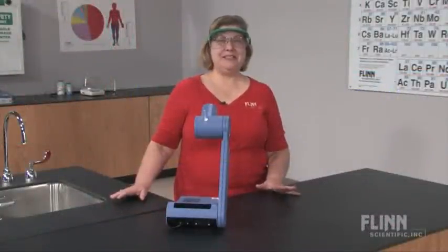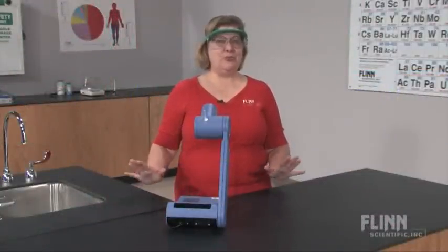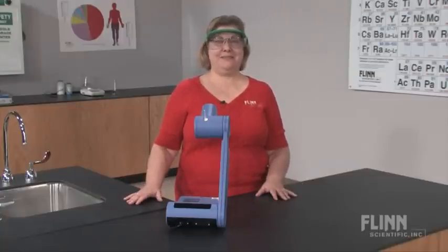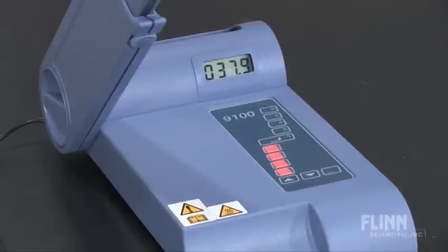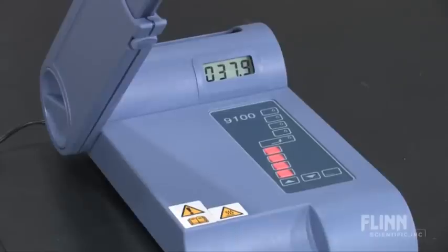Everything is completely digital with the melting point apparatus from Flint Scientific. No more hazardous mercury thermometers or messy hot oil baths. The digital microprocessor provides 0.1 degree precision, fast warm-up, and accurate temperature control up to 400 degrees C.